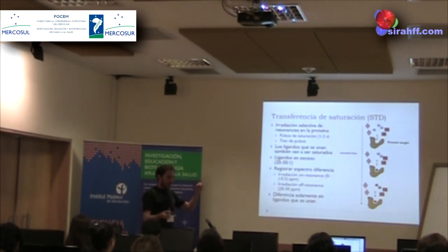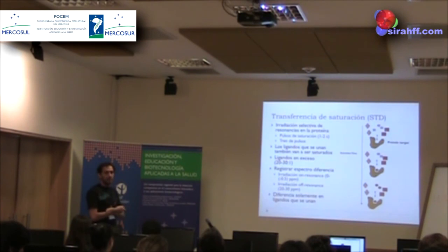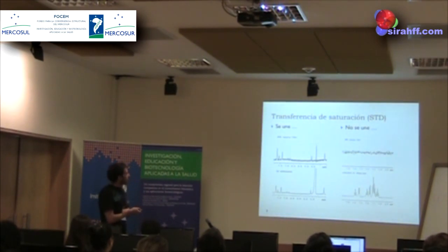Now this saturation can be transferred through space. So if you have this saturated nucleus here, and another nucleus comes by, this saturation can be transferred through space. So if you have a protein and several ligands, you can saturate the protein and expect that ligands that bind the protein will get the saturation transfer, right? It's the kind of experiment you do, and it's the answer you get.